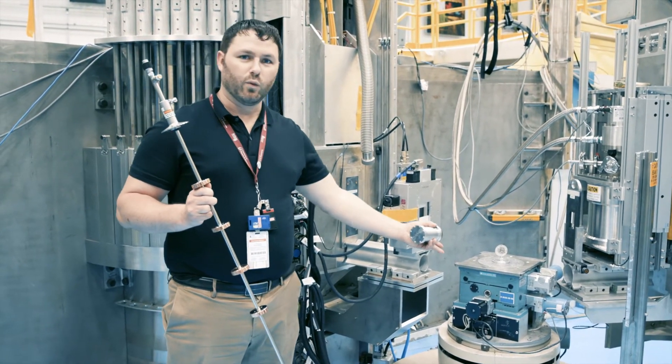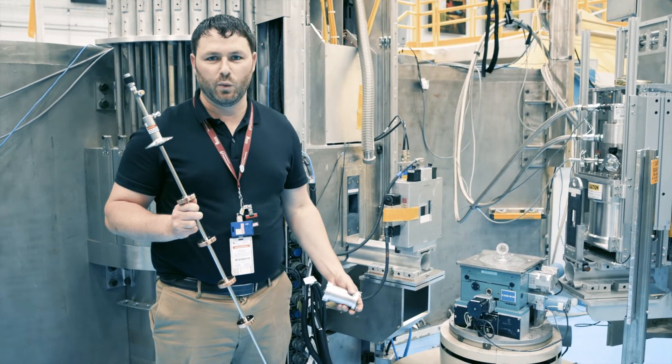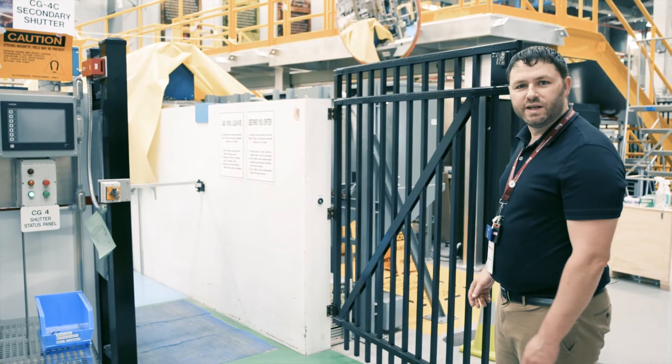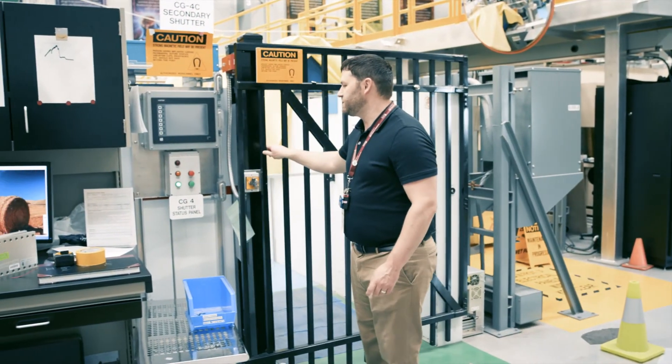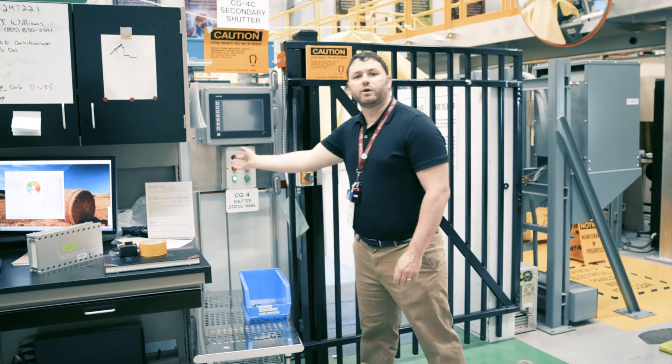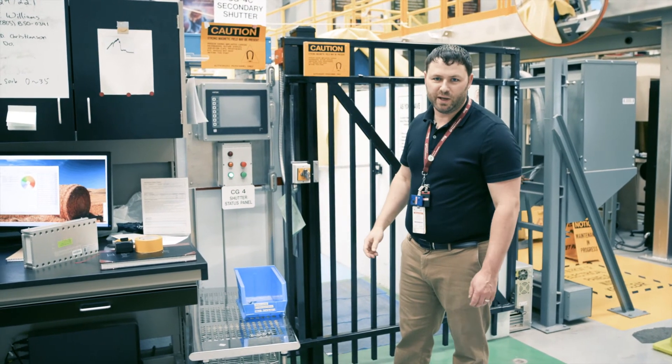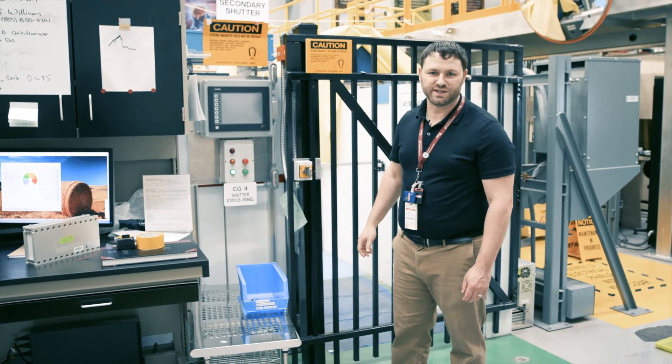Those will then go right here on the sample table so that we can measure them. And finally, when we're ready to do our measurements, we can restrict access to the instrument and turn on the shutter in order to enable neutrons to come down the beam line and scatter off of our sample.